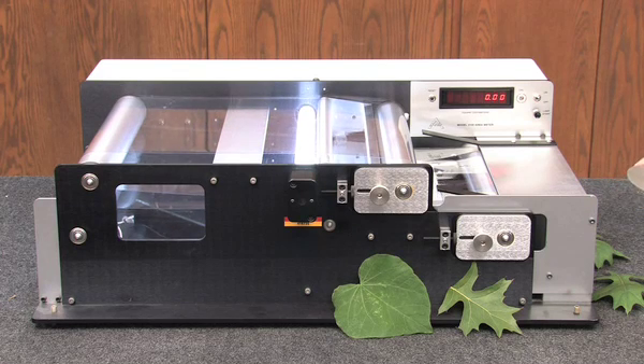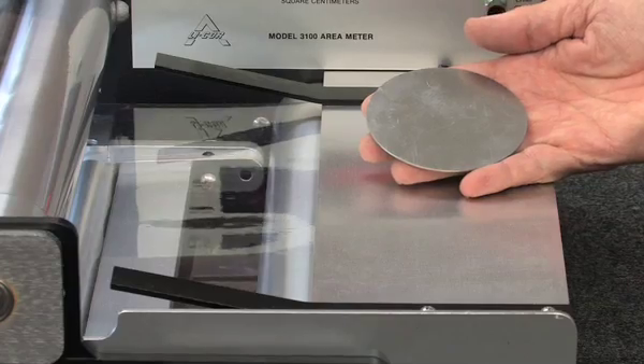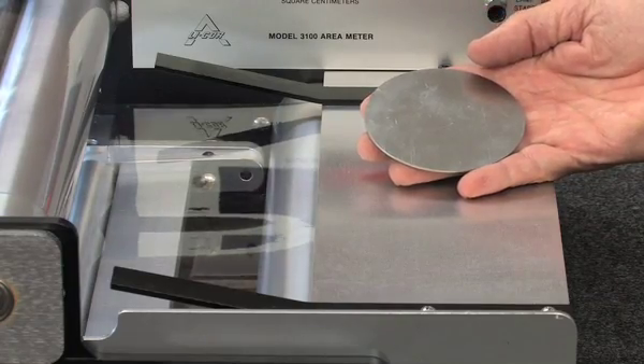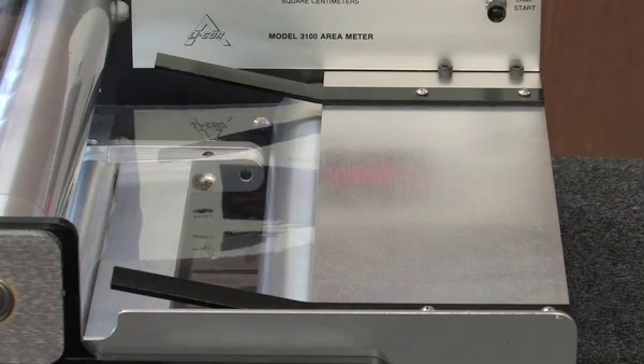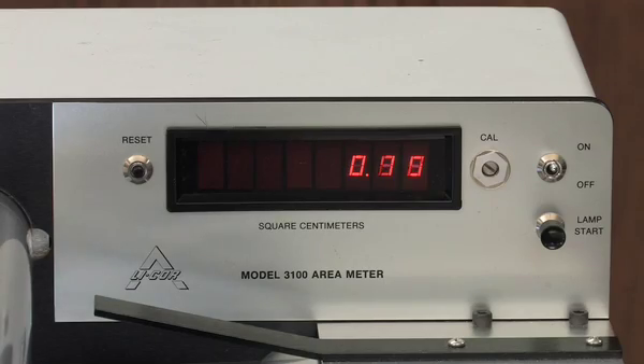Initially, we should check the calibration of the area meter by using a 50 cm² disk. Simply place the disk on the belt and observe the value on the display. A value within 49.8 and 50.2 is acceptable. The calibration is quite stable and class users should not attempt to change it without notifying the instructor.